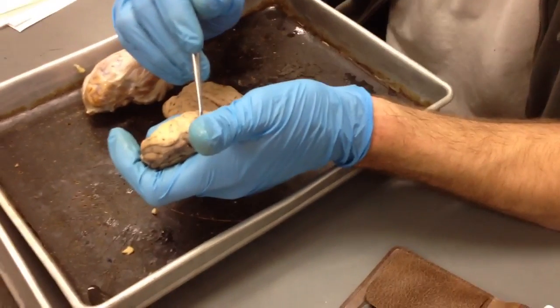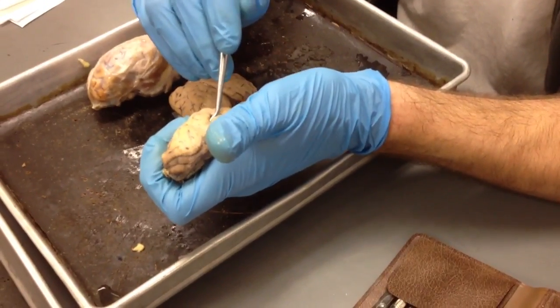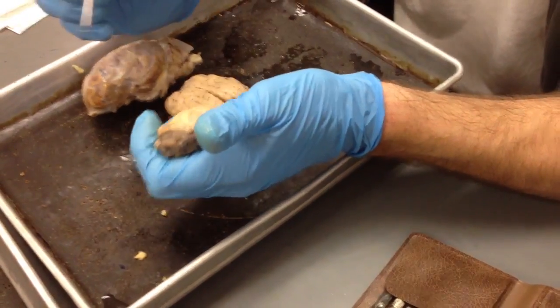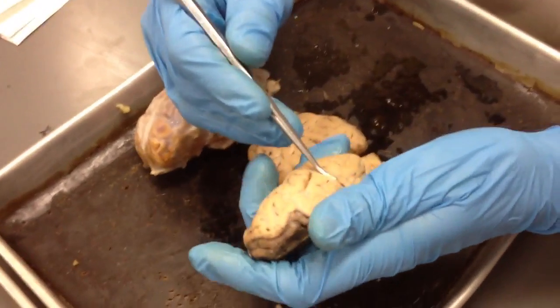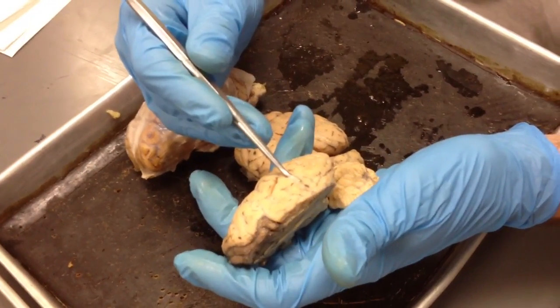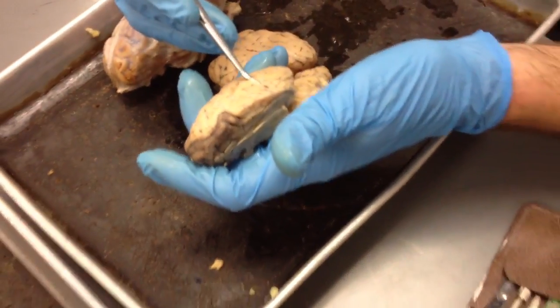So if you follow them down and stick something in here, the meninge being pierced is the pia mater. But if you stick a pin like this and lift up over the crevice, that's the arachnoid.